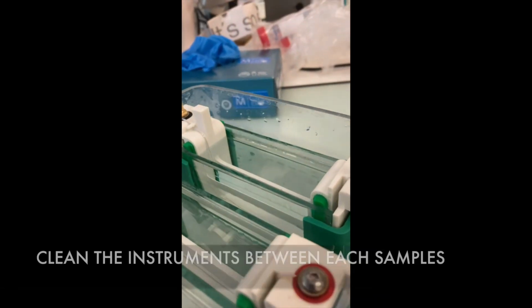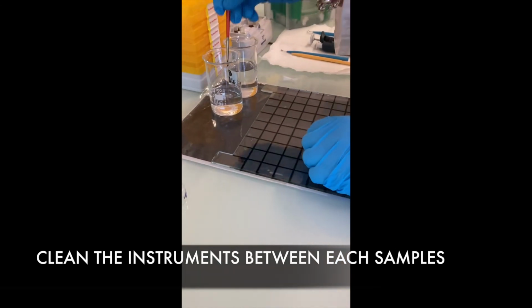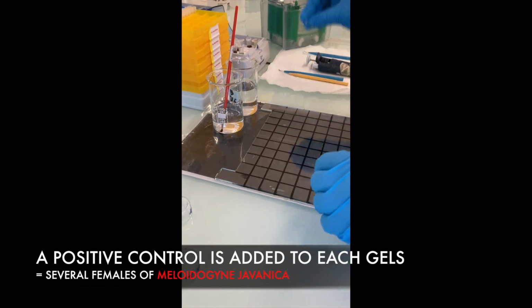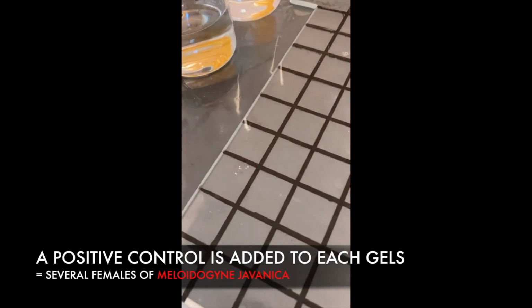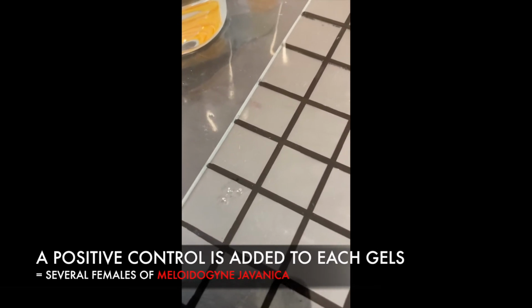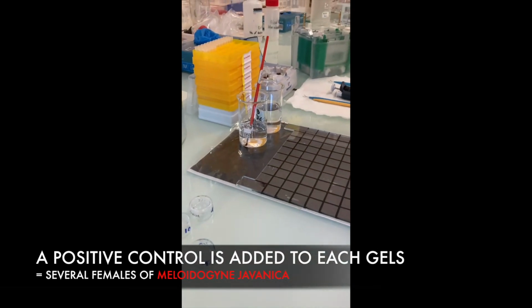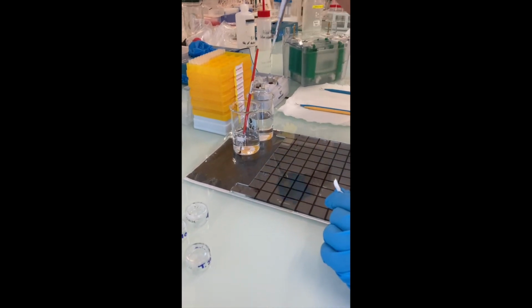Be sure to clean the tools between each sample. A positive control is loaded on each gel. These are several females of Meloidogyne javanica. Indeed, this species has a typical esterase profile consisting of 3 bands, allowing the identification of other root knot nematode species.